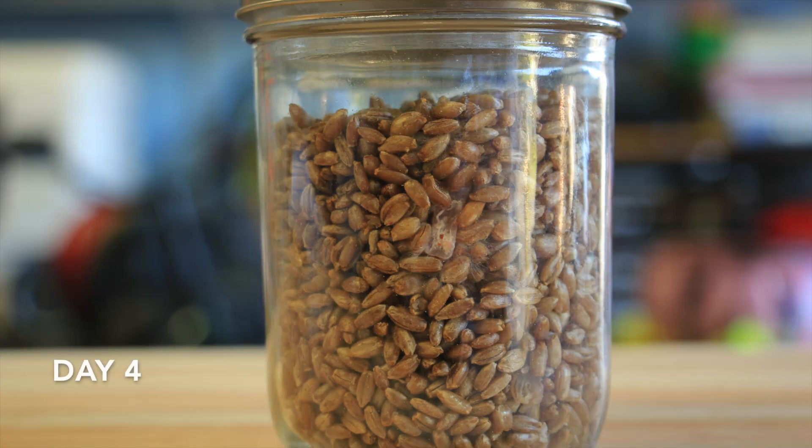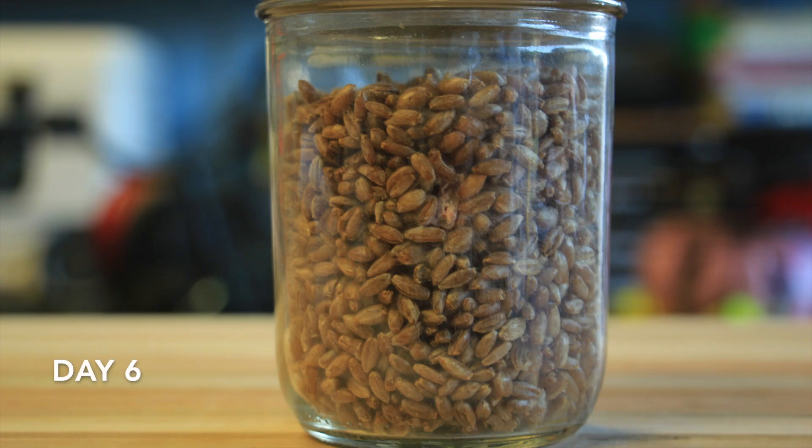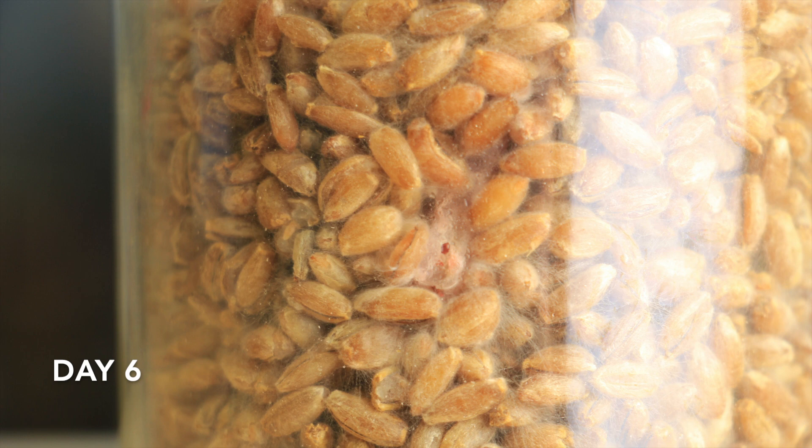One thing you'll notice right from the beginning is on the agar there's a couple of orange dots, and those are actually rust. After I made the lids I forgot to clean out the metal chips, and so I ended up getting a metal chip embedded in the agar wedge and then it rusted.